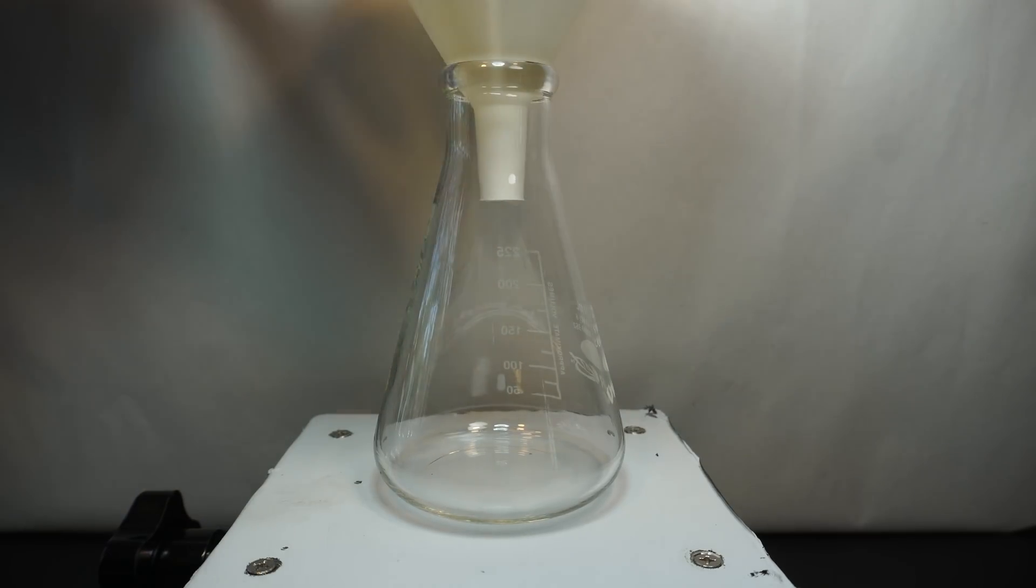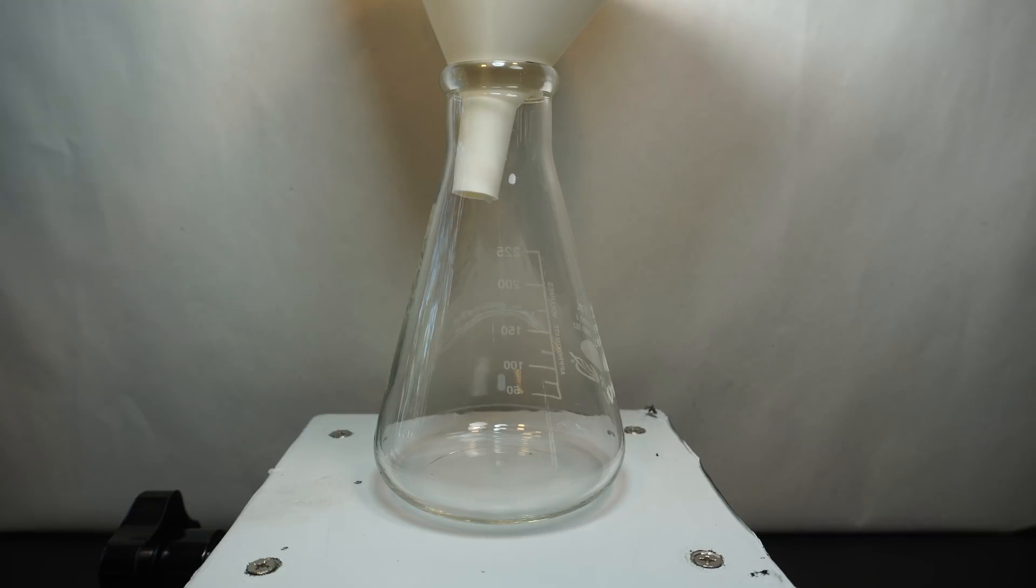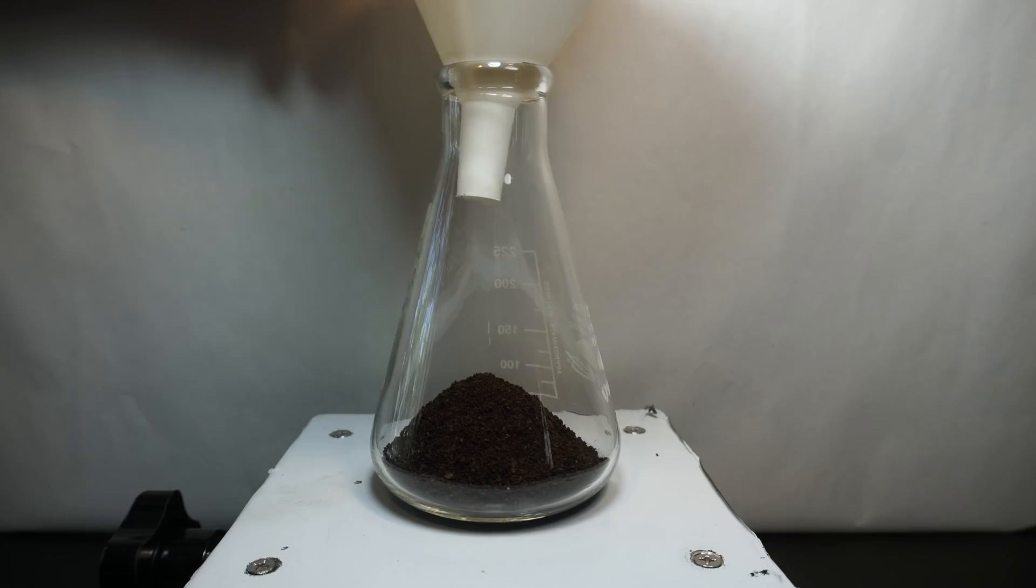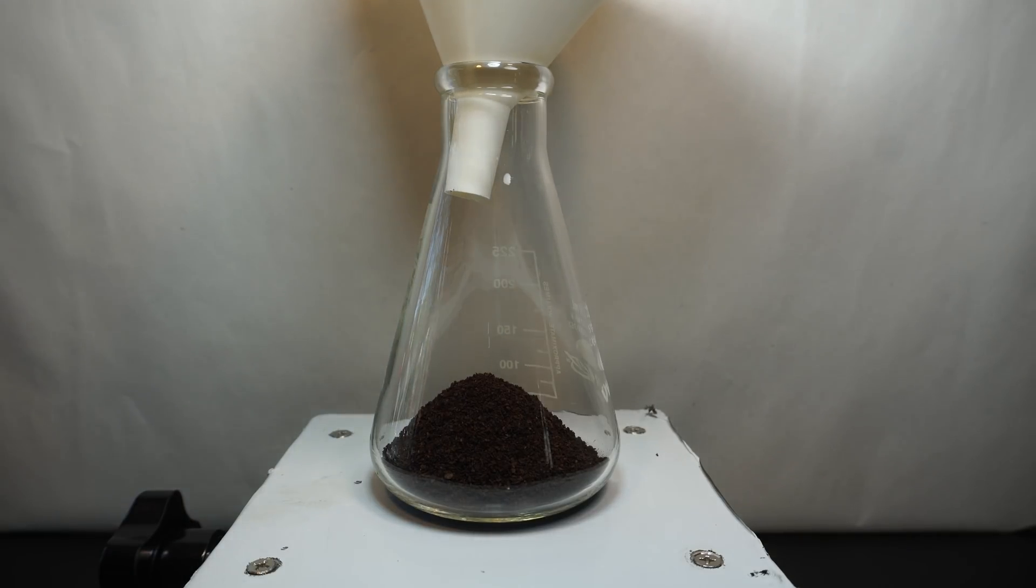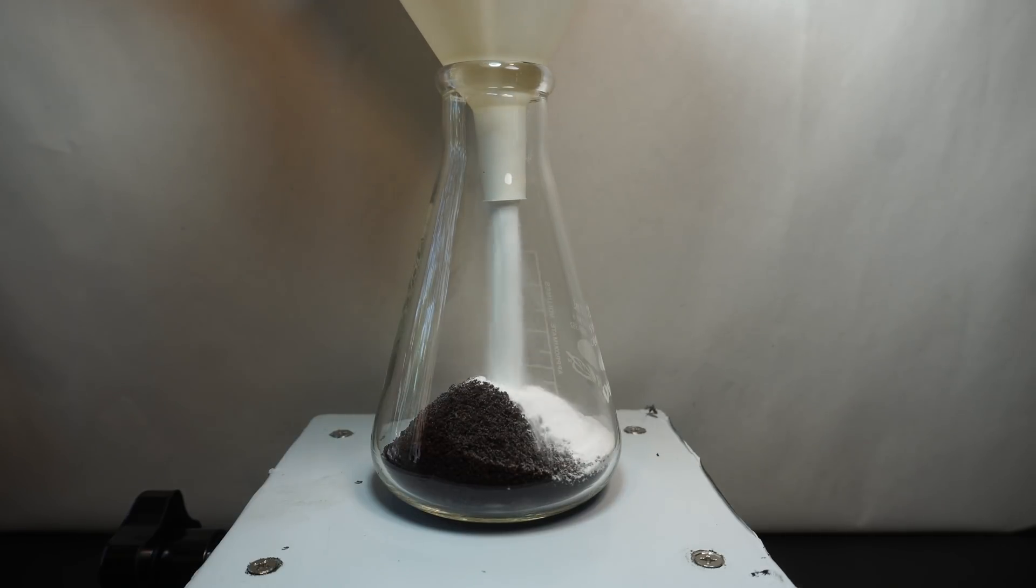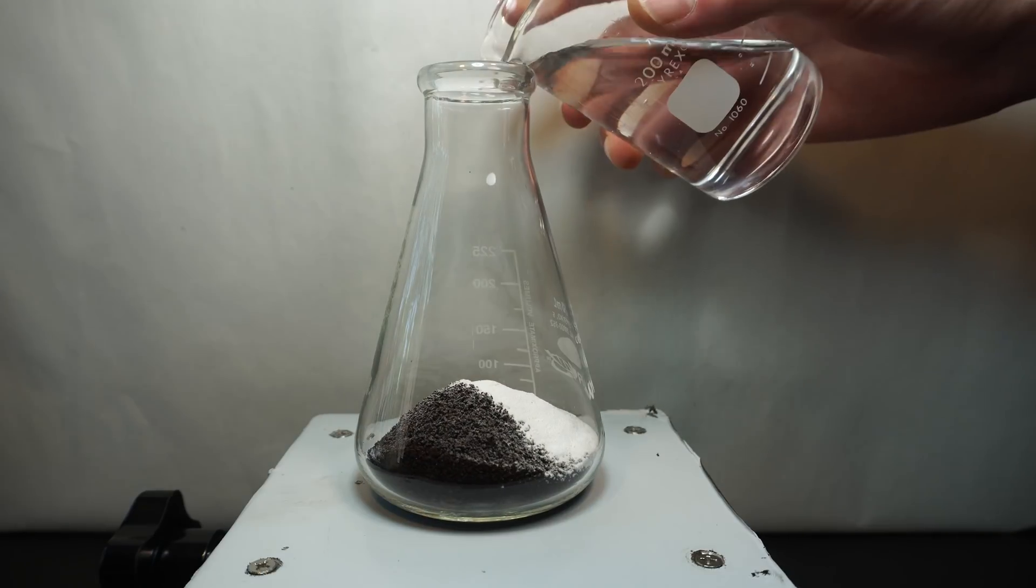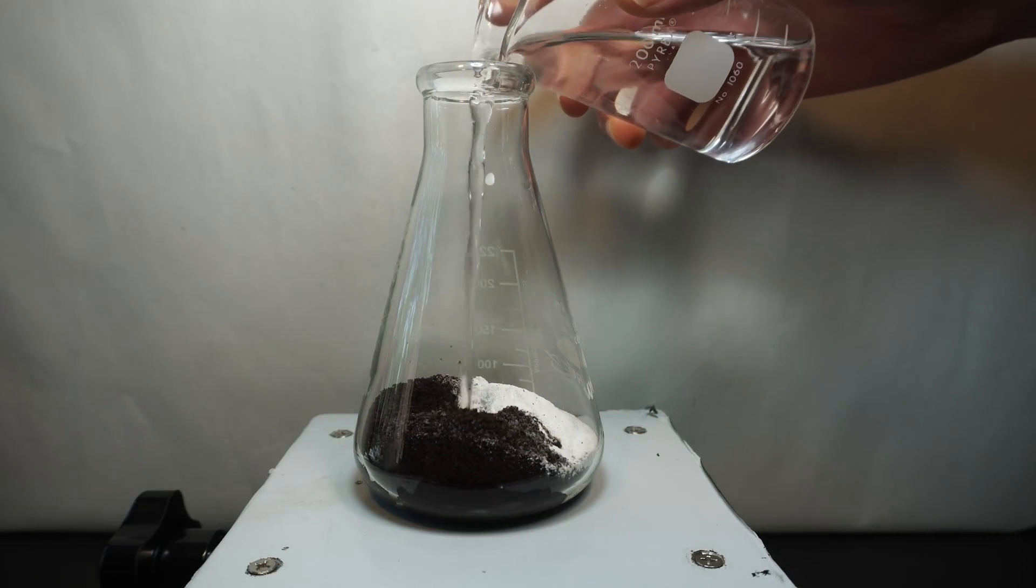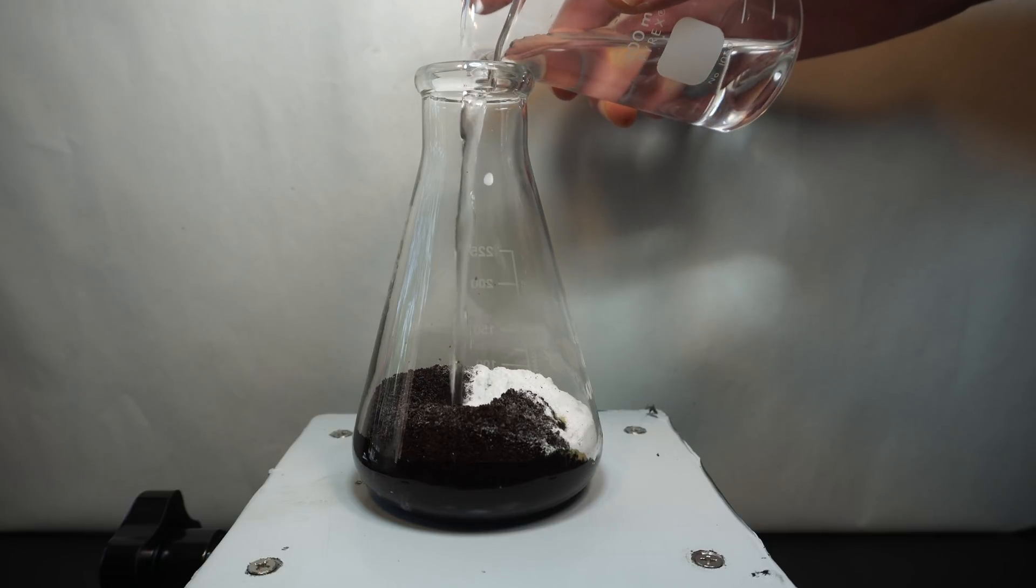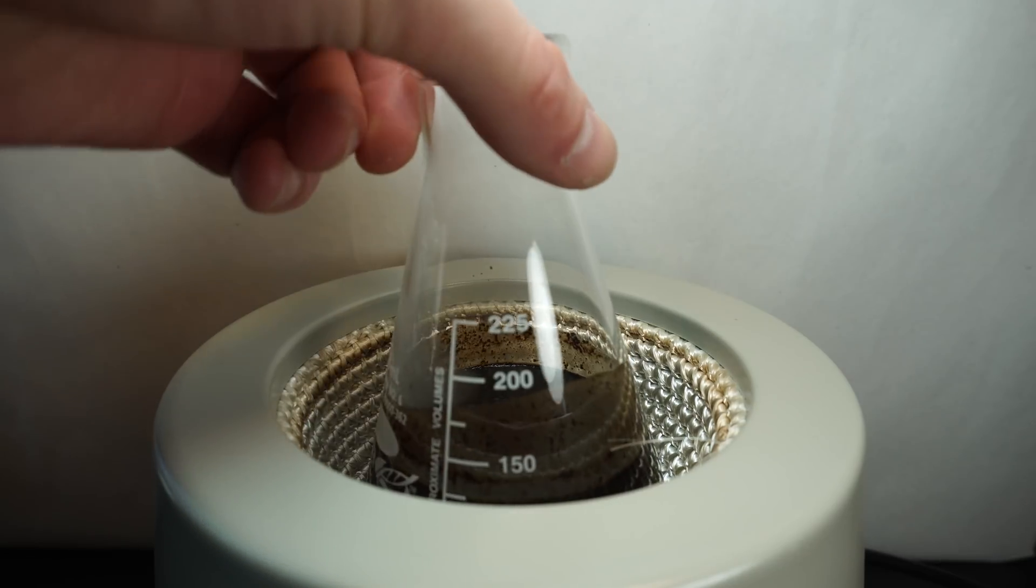First we have to make the coffee. In an Erlenmeyer flask I add 20 grams of Death Wish coffee, followed by 7.2 grams of sodium carbonate. The sodium carbonate will react with the tannins in the coffee to make them more water soluble. Then I add 100 milliliters of distilled water and bring the coffee to boil.